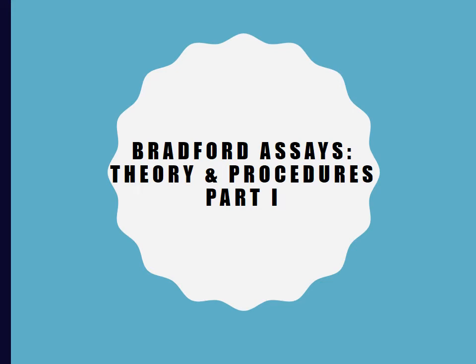So this little video is meant to help you prepare for our protein analysis lab, where you are going to be determining the concentration of protein in 2 different food samples that you are bringing to lab. And so I want to give you just a little bit of background about what exactly is a Bradford assay, what's the theory behind how this works in order to determine our protein concentration.